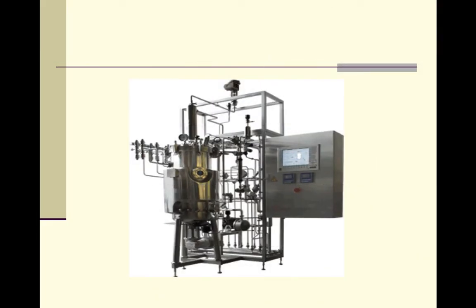The fermenters are usually double walled or jacketed to take care of the cooling and temperature requirements of the fermentation, and there is a control panel which actually automates the entire process of probing for oxygen, pH, etc., and makes it very, very user friendly.